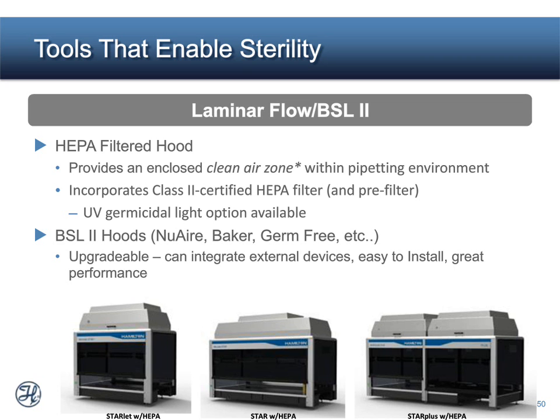The other option to consider was putting the liquid handler into a biosafety level 2 cabinet. Companies such as NuAire, Baker, Germfree, and there's many others out there offer very seamlessly integrated biosafety level 2 cabinets that liquid handlers can go into. They also allow for integration of third-party devices or other devices such as incubators or imagers that can be integrated nicely with the liquid handler.